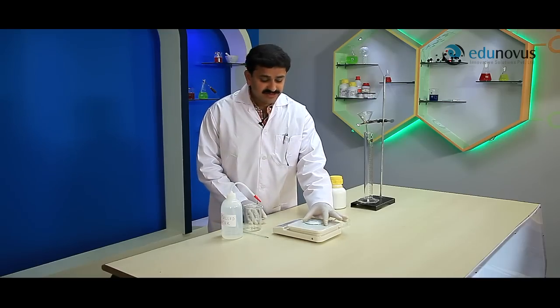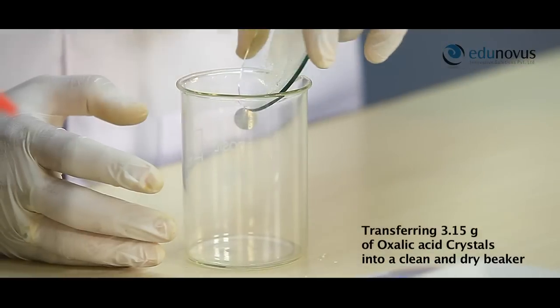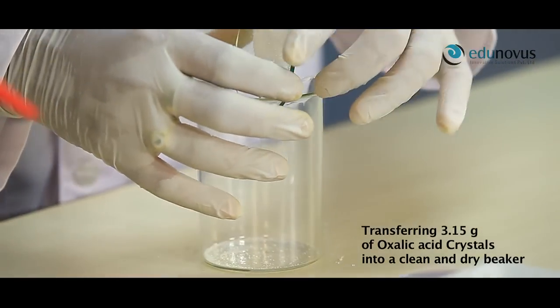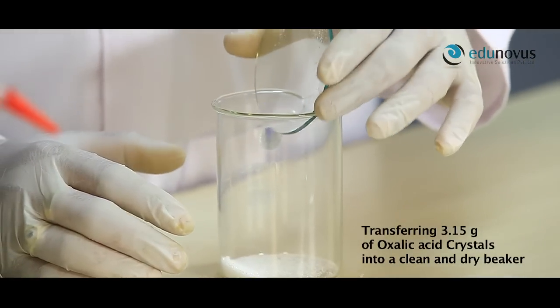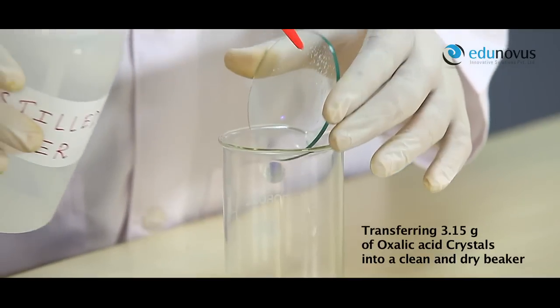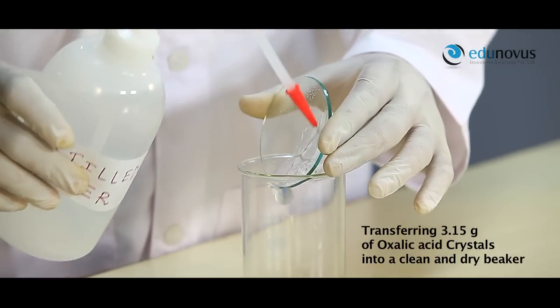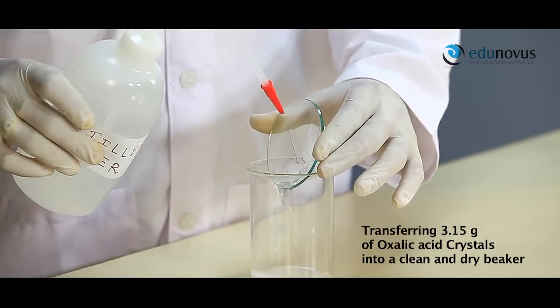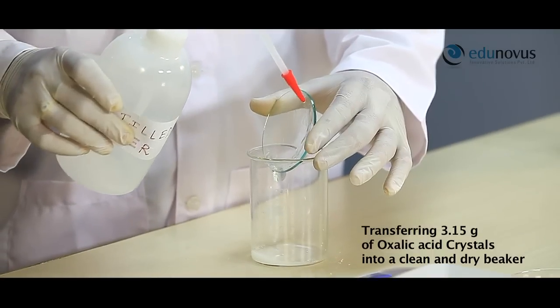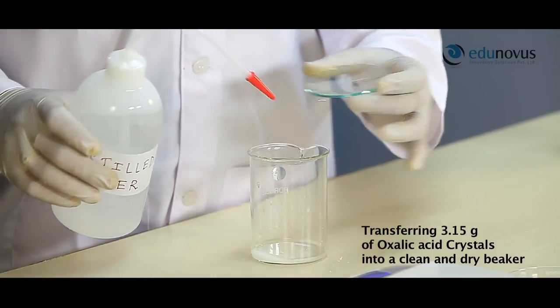Now transfer this 3.15 grams of oxalic acid into a clean and dry beaker and then wash the watch glass with distilled water to transfer the particles of oxalic acid sticked on it into the beaker.